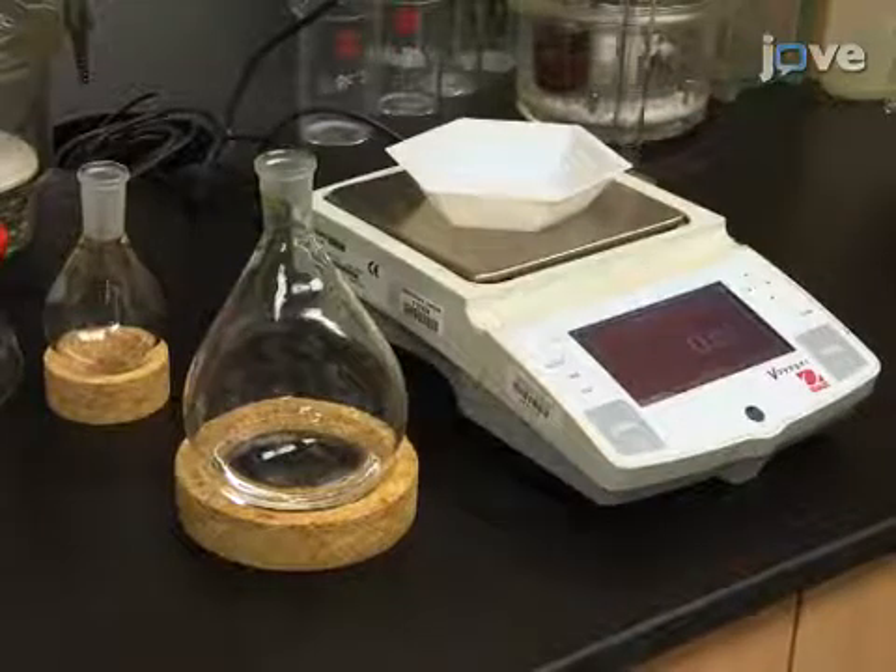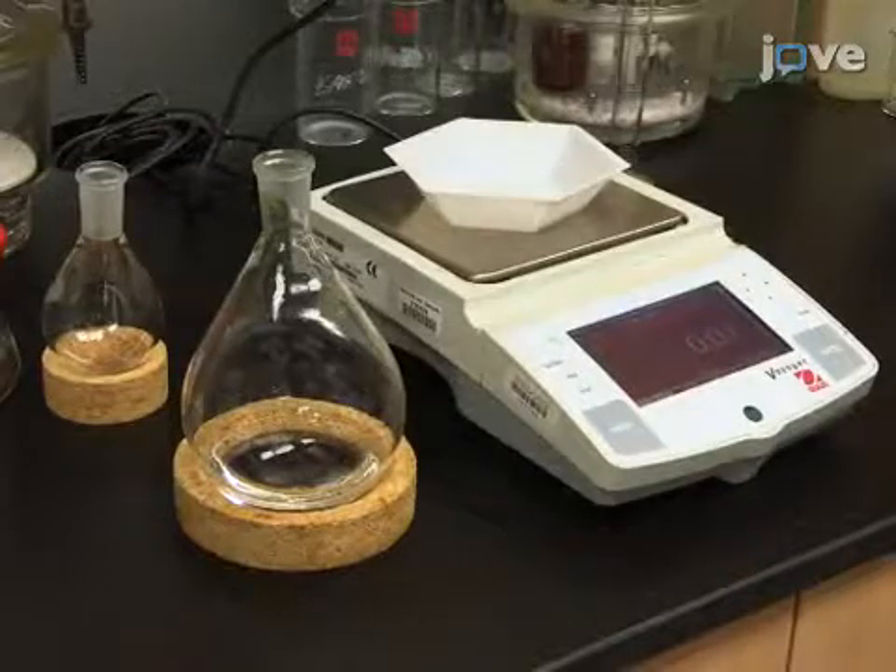To begin this procedure, prepare the reagents as outlined in the text protocol.